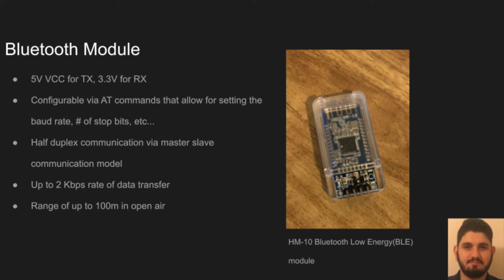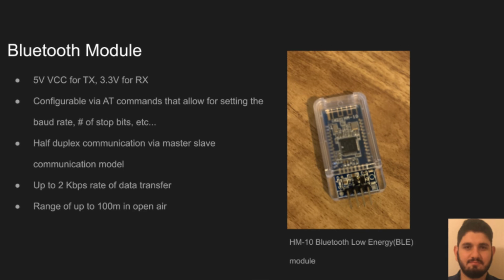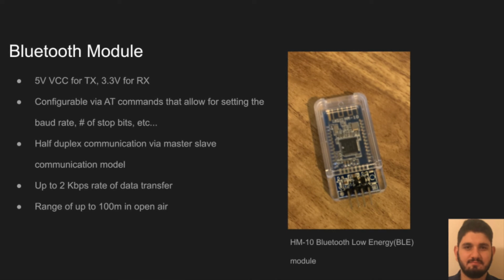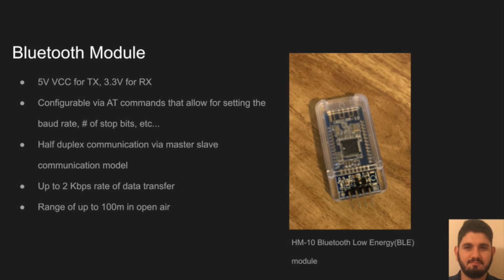The Pin Transfer Robot Progress Monitoring app is a companion app that is provided to the researcher to notify him or her on the progress of the robot. To use it, the user must tap the Scan button, select the HM10 BLE module, and simply tap the Connect button to connect to the BLE module.